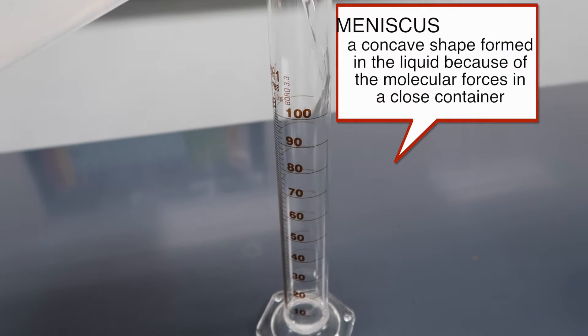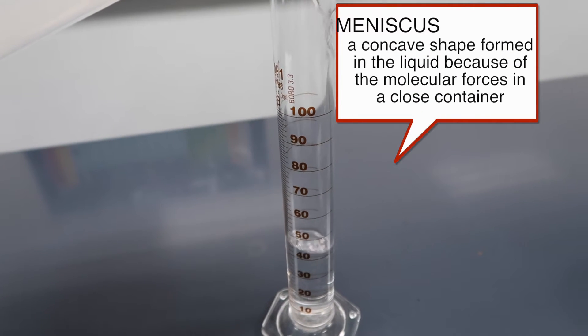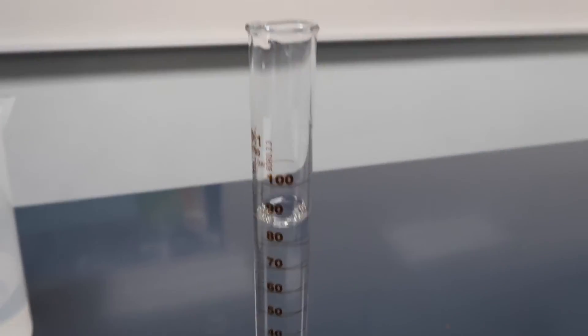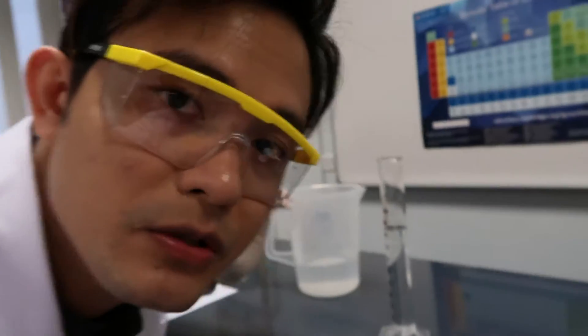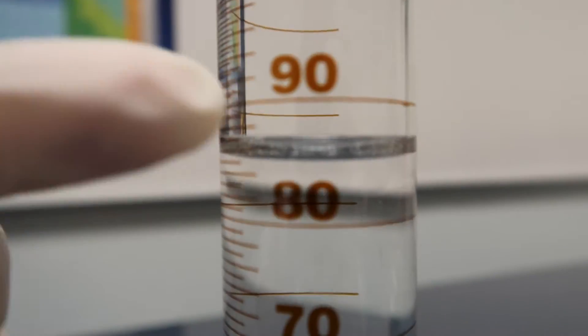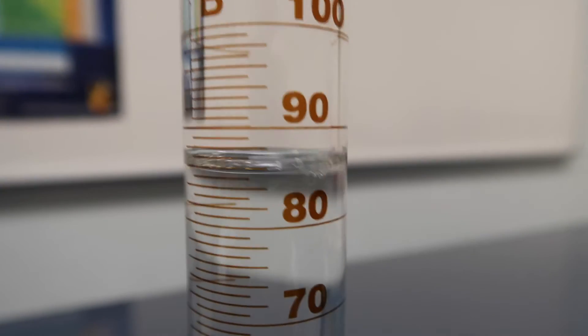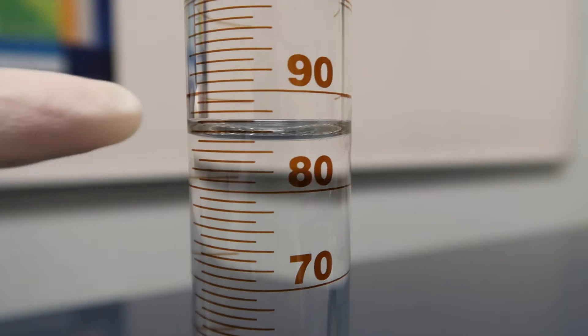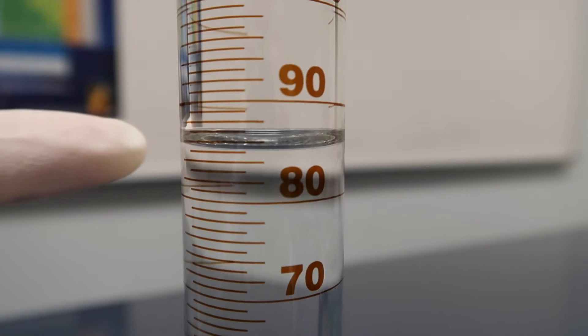Meniscus is when the liquid tends to stick to the side of a closed container. For example, this one. We need to read this at eye level. You guys will see, this is the meniscus. You can see the meniscus, that's the meniscus. Forces tend to stick at the side.